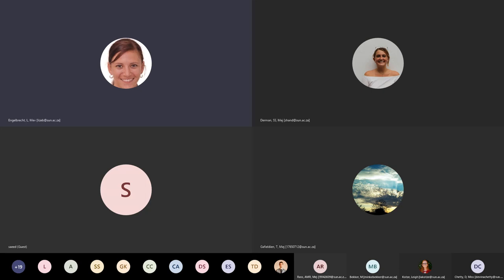You don't necessarily have to put the scale bar on the image, but you have to have a line there with known length, and then you have to indicate in your figure legend what the length of that line is. Many journals won't accept anything if there's no scale in there. For images where the scale bar was not shown, what would you advise? This is exactly why I said you need to have your raw data available. The scale bar might not be on your image, but because your raw data will have the scaling information, it will allow you to put a scale bar on after you've had your images.